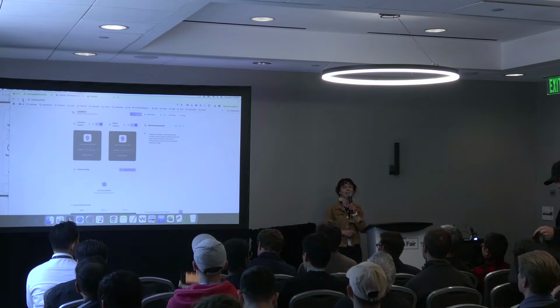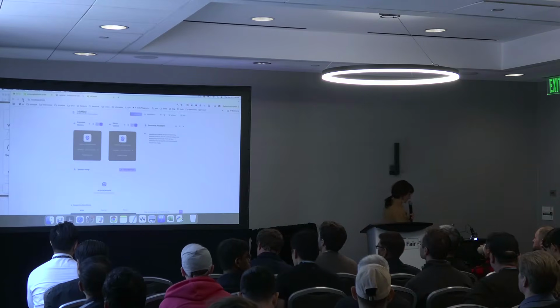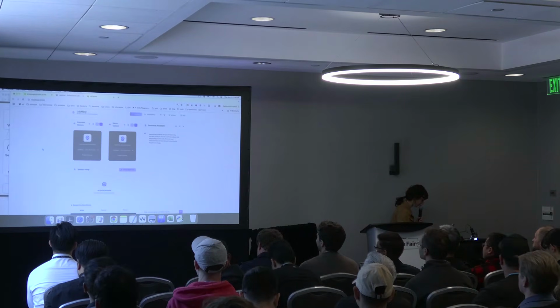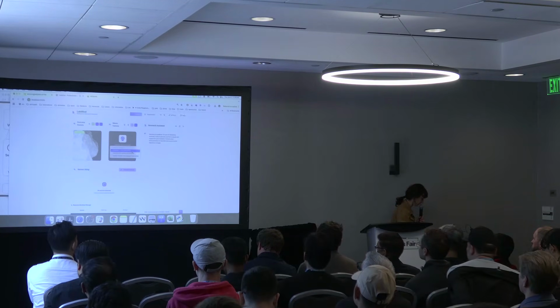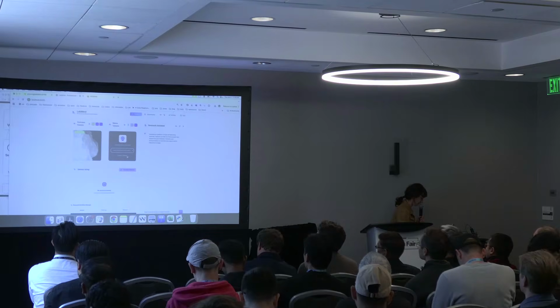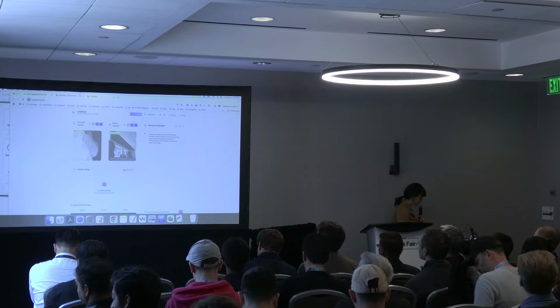So we're going to start with a live demo, and then we'll switch to the presentation, just to swap things around. So I'm going to try to connect the microscope over here, and let's see the other camera, and some sensors.